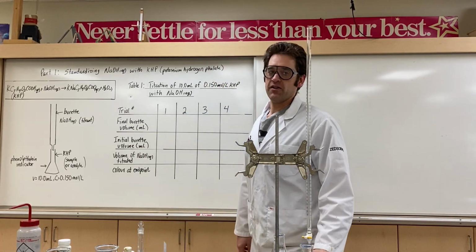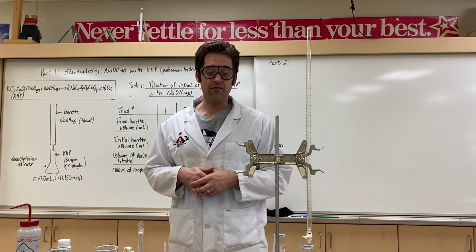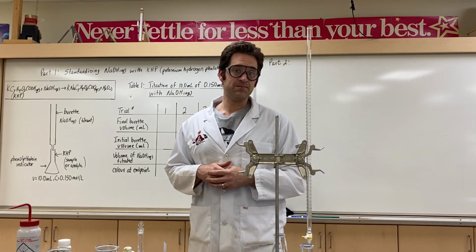We're going to be showing you guys how to do a titration, but more importantly, it's a two-step titration with a lot of really good lab skills involved. We are going to be first standardizing sodium hydroxide and then using that to titrate vinegar.